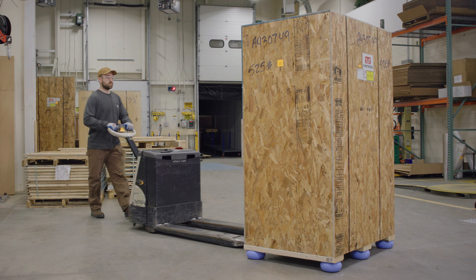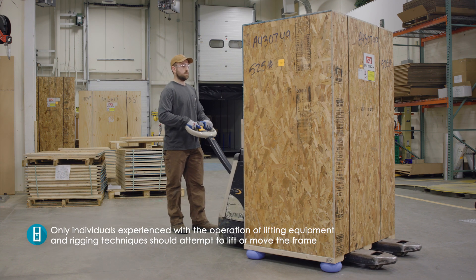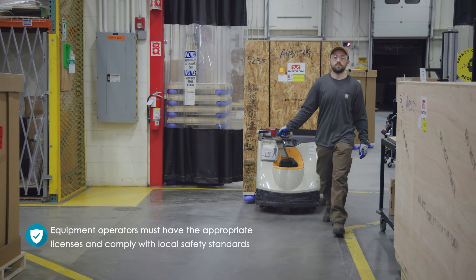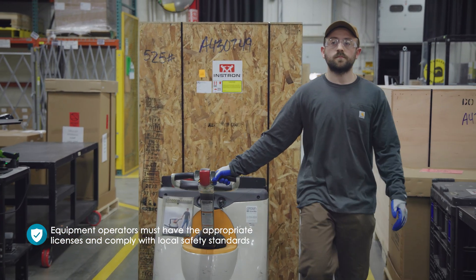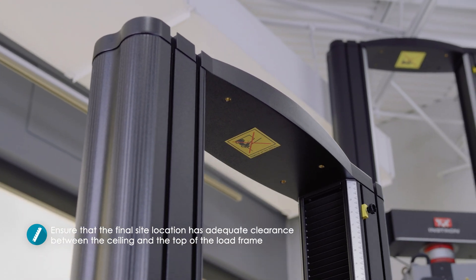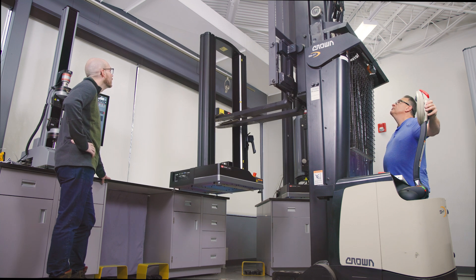Additionally, you'll want to ensure the following. Only individuals experienced with the operation of lifting equipment and rigging techniques should attempt to lift or move the frame. Equipment operators must have the appropriate licenses and comply with your local safety standards. Ensure that the final site location has adequate clearance between the ceiling and the top of the load frame, including clearance for lifting the system via crane or forklift.